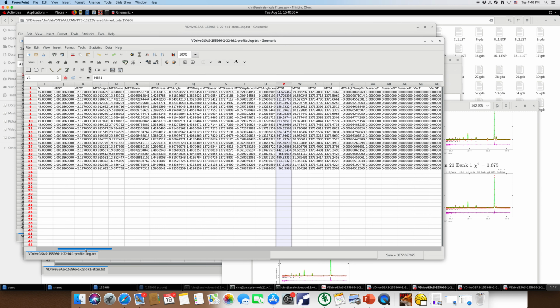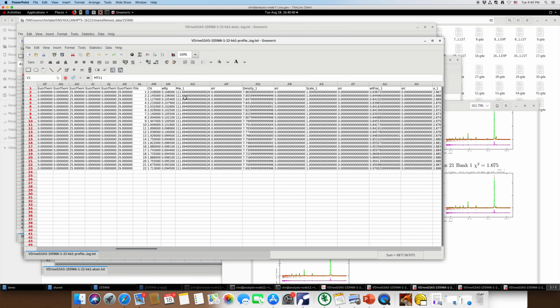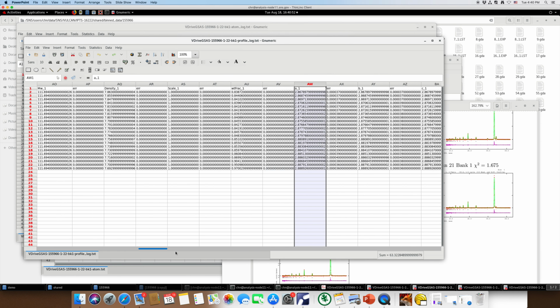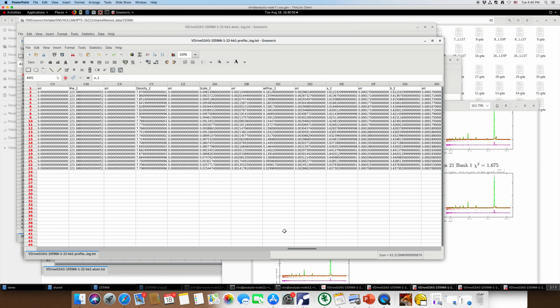If we move forward, we'll see here is the information of the phase 1. Here _1 means the phase 1. We'll have this is the weight fraction, and also this is the lattice parameter, and so on. If you keep going, you have the information from the phase 2. The _2 is the phase 2. Okay, so let's try to plot.